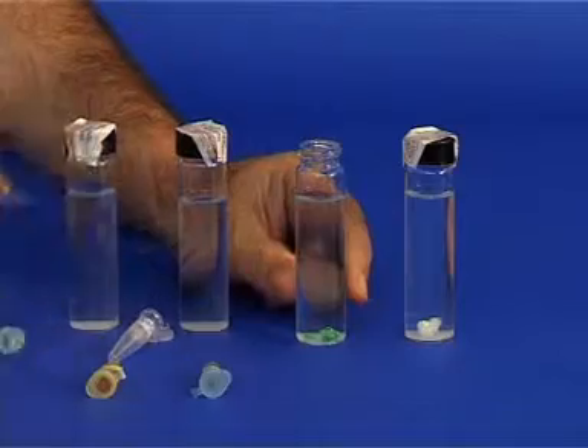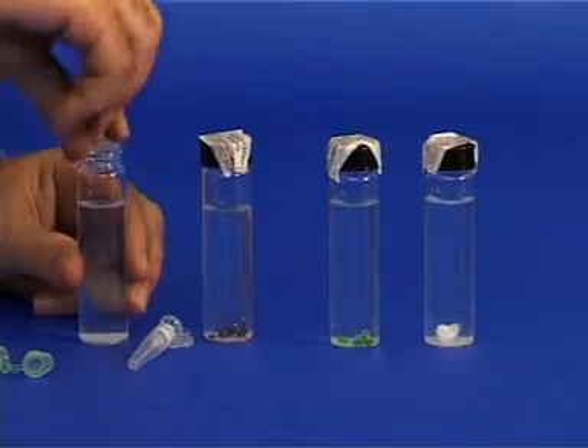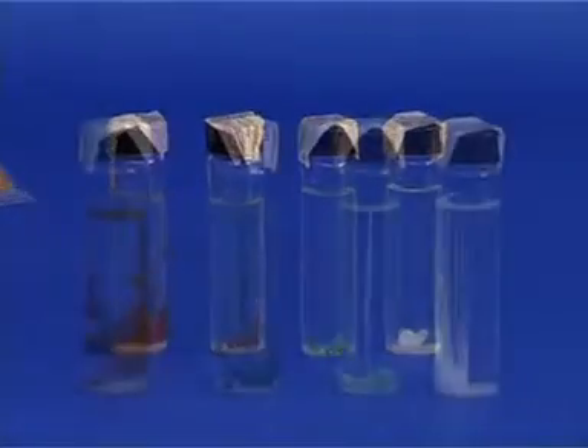The glass containers should stand undisturbed for several hours. After this time has elapsed, you will see that a beautiful structure that resembles plants has formed.